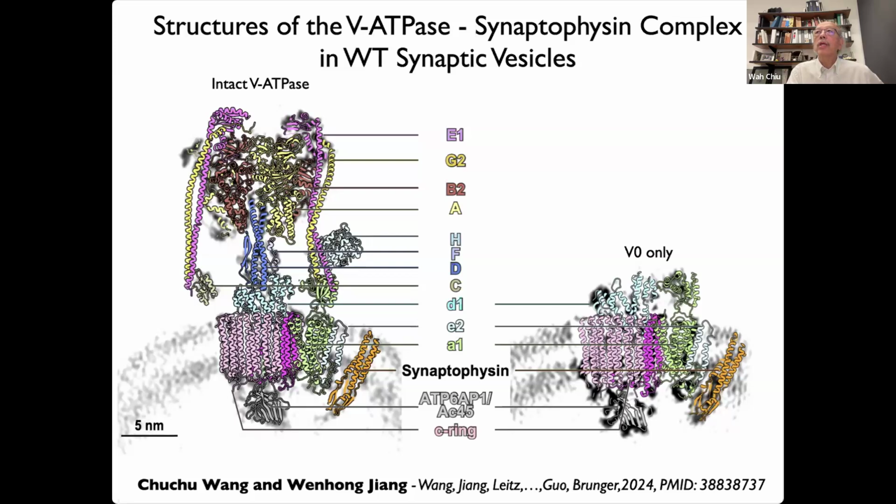Okay, and another question raised is, have you been seeing any nucleic acid inside the synaptic vesicles? So these are purified synaptic vesicles, so we wouldn't expect nucleic acids, but we would of course expect to see neurotransmitter molecules. They presumably are disordered, so we don't see any distinct densities inside the synaptic vesicle. It's a good question, but there's nothing that stands out, perhaps as expected.